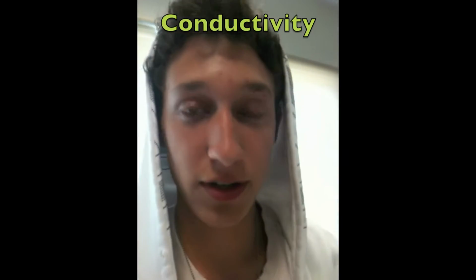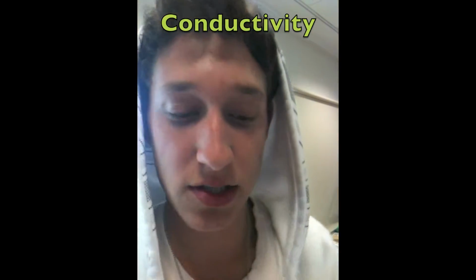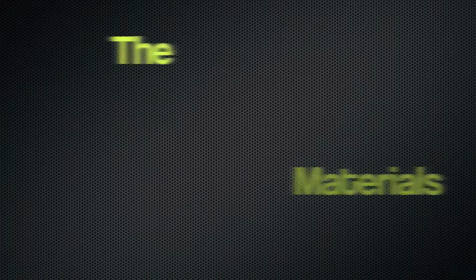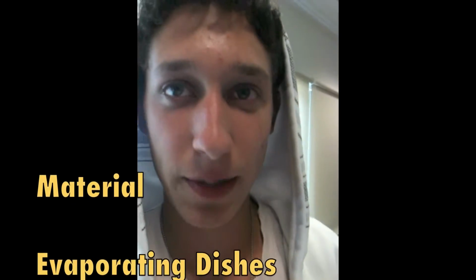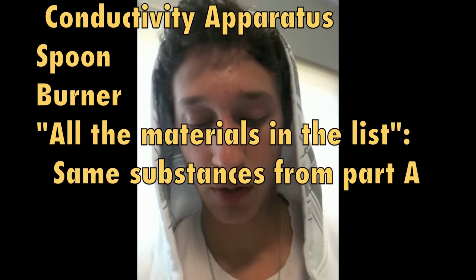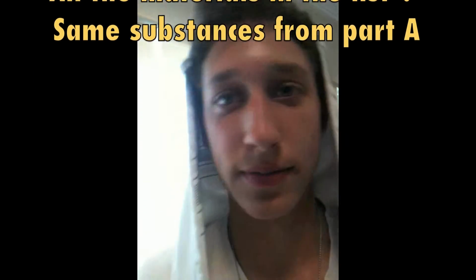Objectives for part B are to compare the conductivity of ionic and covalent compounds as solids, liquids, and dissolved in solvents. Materials are evaporating dishes, conductivity apparatus, spoon, burner, and all the materials listed in the chart. Goggles, do not forget.